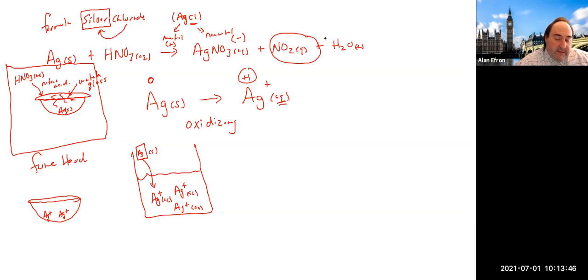There's definitely other things in there. It's not important. This is lost along the way out the top there, and as it's all sort of done. Now, once it's all reacted, we have our silver in the right position to allow us to make basically silver chloride.